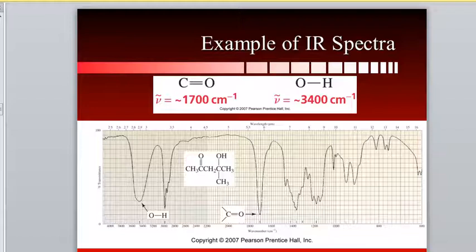And then another dip happens and it comes back up, and then another dip and it comes back up. So this is what we call the spectrum. And these are what we call shifts or spikes or absorption bands. We are absorbing light. Okay? Something to look for on the graph.